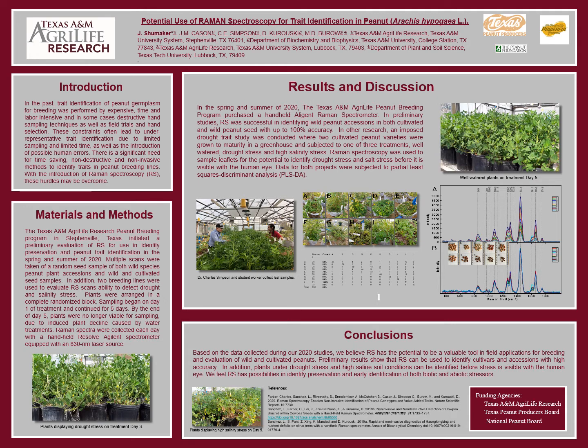Plants were arranged in a complete randomized block. Sampling began on day 1 of treatment and continued for 5 days. By the end of day 5, plants were no longer viable for sampling due to induced plant decline caused by water treatments. Raman spectra were collected each day with a handheld Resolve Agilent spectrometer equipped with an 830 nanometer laser source. Data for both projects was subjected to partial least squares discriminant analysis.